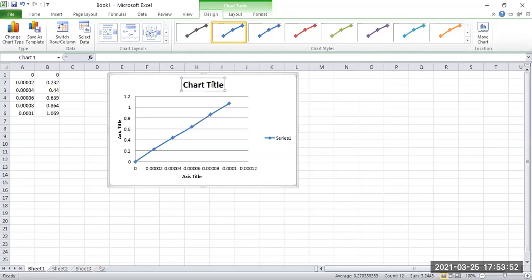All right, so we're going to do FeSCN versus absorbance. And then click on this, and this is my absorbance part. So yes, and this is my FeSCN, and in molarity.